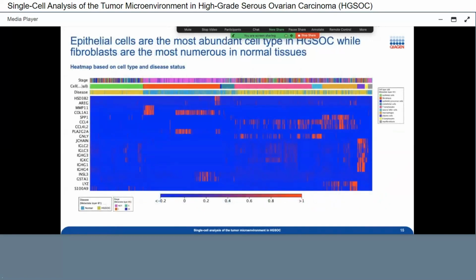But we can also look at a heat map based on the cell type and the disease status. In other words, based on 20 genes here, in which cell types are these genes the most represented? So it's based on the expression intensity here. The more red, the more expressed, right? But what I would like to show you here are these three legends. We have one for the disease, one for the cell type, and there's a color code here on the right, and one for the stage is a little bit more confusing.